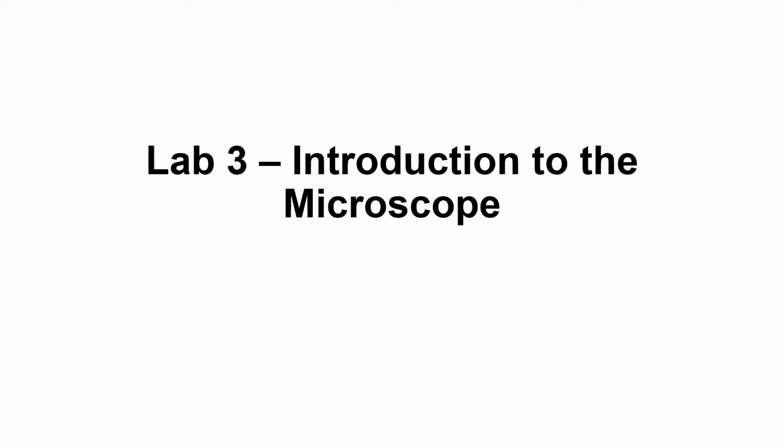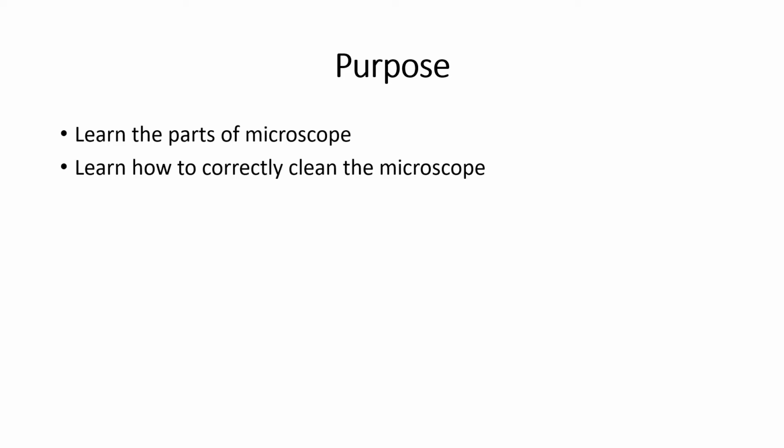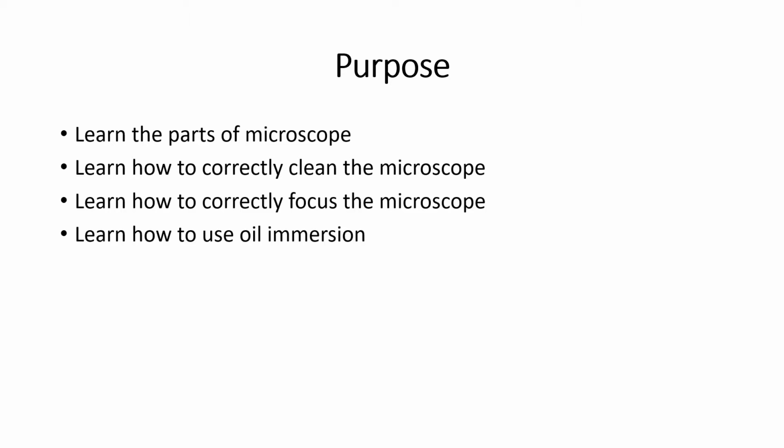This is the lecture for Lab 3, Introduction to the Microscope. The purpose of this lab is to get you familiar with using a microscope, and that will include learning the parts of the microscope, learning how to correctly clean the microscope, learning how to correctly focus the microscope, and learning how to use oil immersion.